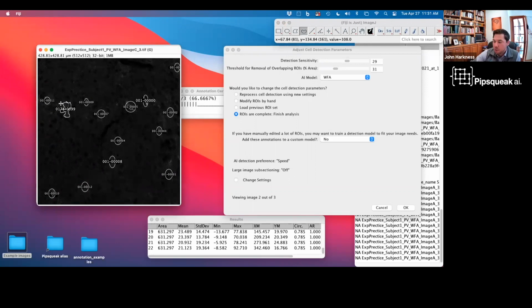You're also able to do that form-fitting ROI through our threshold detection. And this is something that's not available yet, but we are working very hard on enabling: that form-fitting ROI is going to be available through the AI analysis. Basically, we're adopting a new AI technique there. Instead of doing object detection, we're going to be using some image or instance segmentation technology to really hone in on just the bounds of that cell. And so that should really answer that question. Until then, I think thresholding or drawing it is a great method.